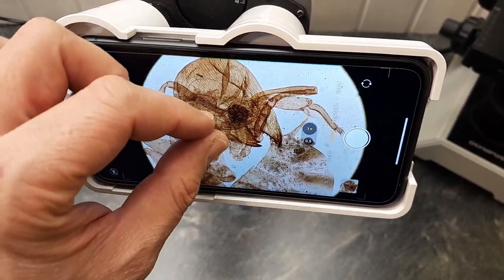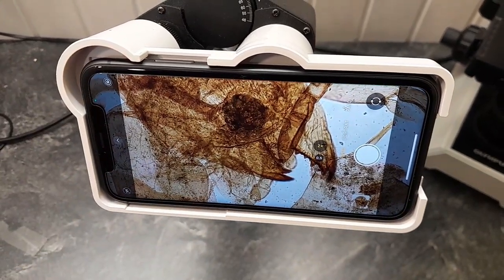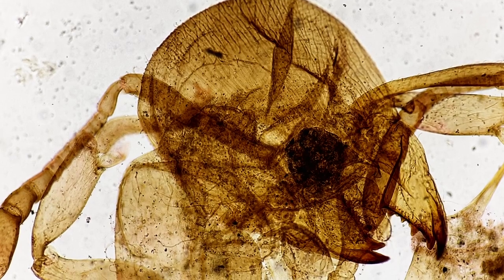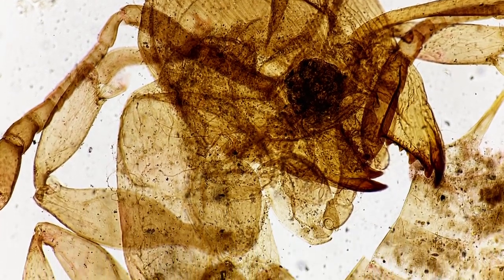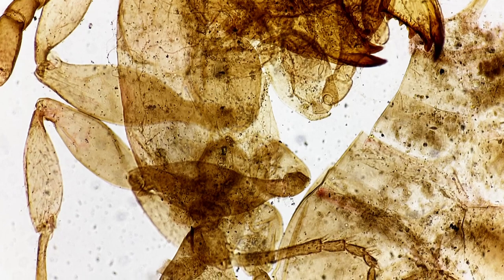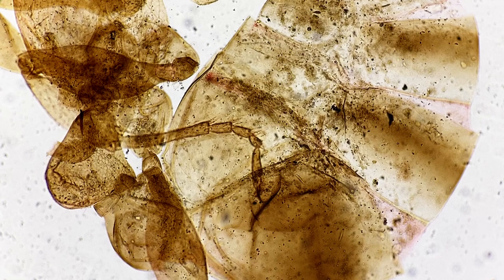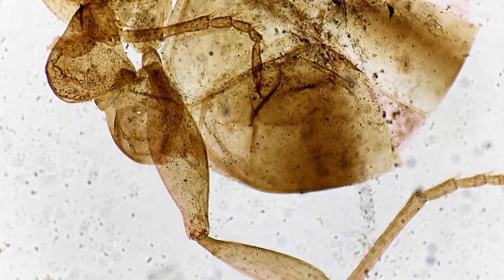And how does this now look under the microscope? Here it is again, that's an ant, it's a commercially prepared slide of an ant and as you can see it looks very nice and I have to tell you that I think that this mobile phone adapter indeed is one of the better adapters that I have seen because also everything is pre-adjusted and aligned here.